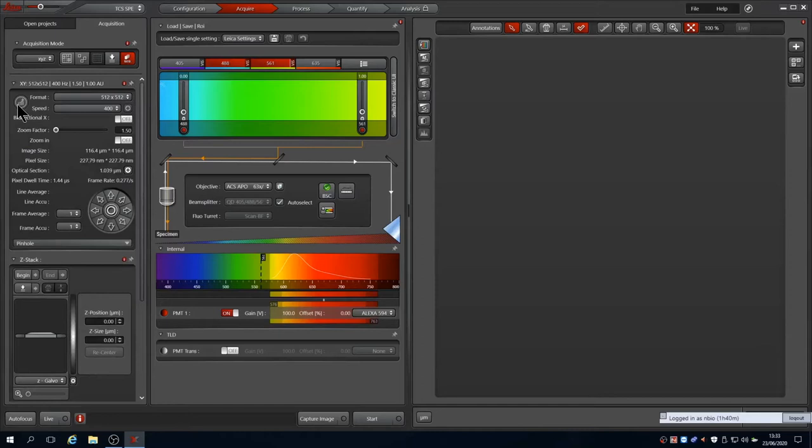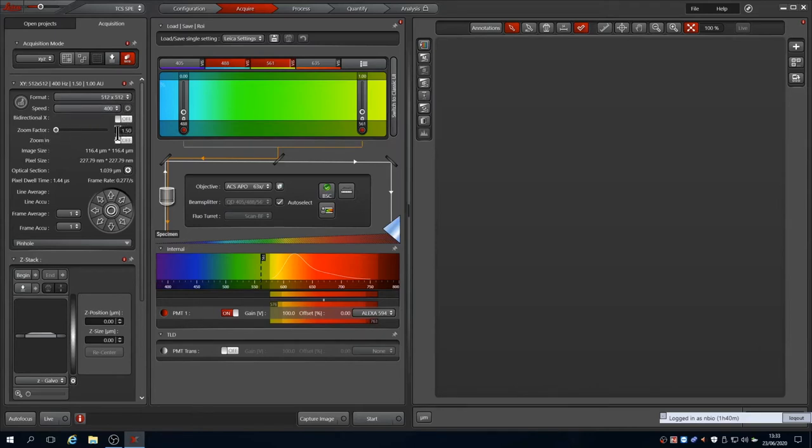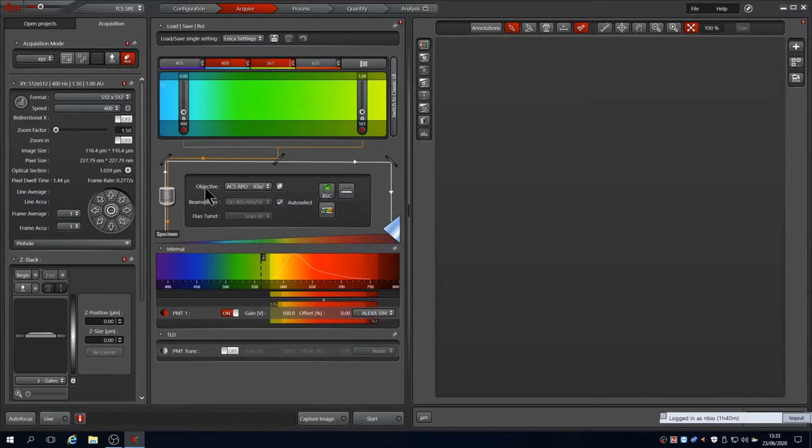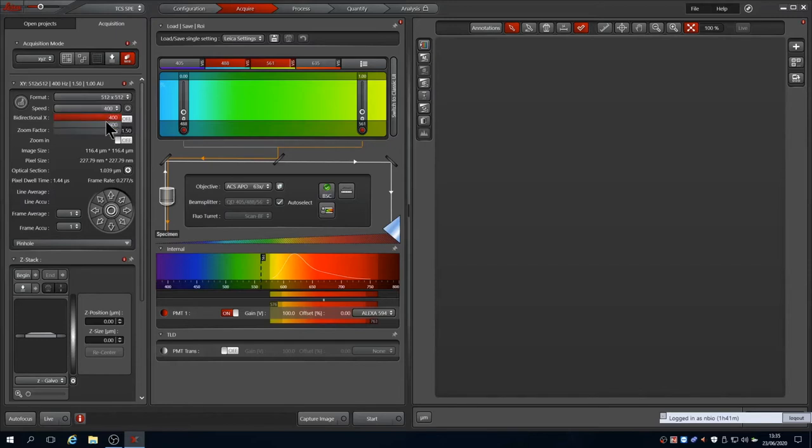Beneath pixel format and scan speed, there is an option for bi-directional and then zoom options, which can be adjusted with the slider or typing in the box. This is also available via the control dials under the monitor. Beneath the zoom are the image parameters calculated from the current objective. In this case, it is a 63 times oil immersion lens. And therefore, a 512 by 512 scan at zoom 1.5 corresponds to an image of 116 microns and pixel sizes of 227 nanometers.